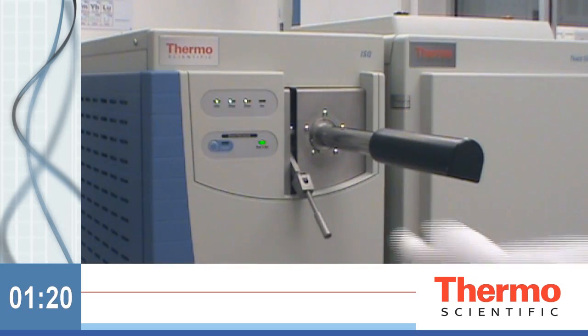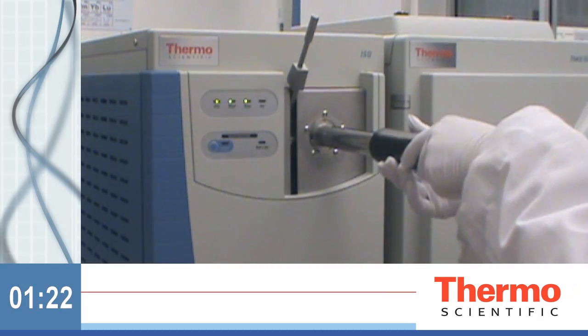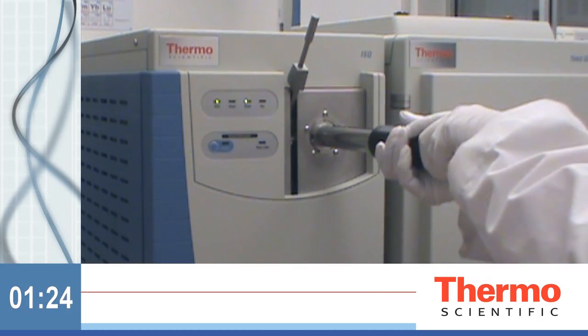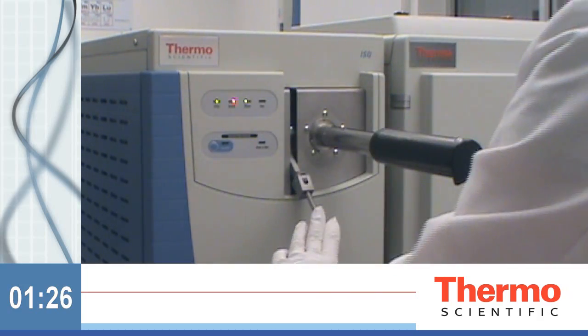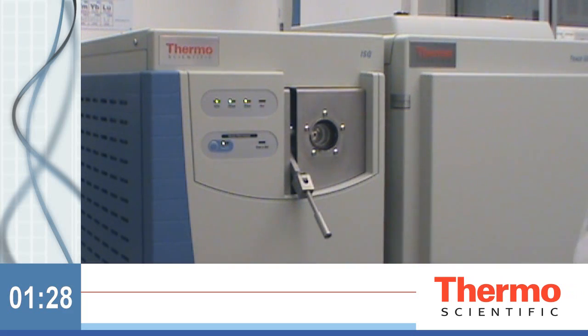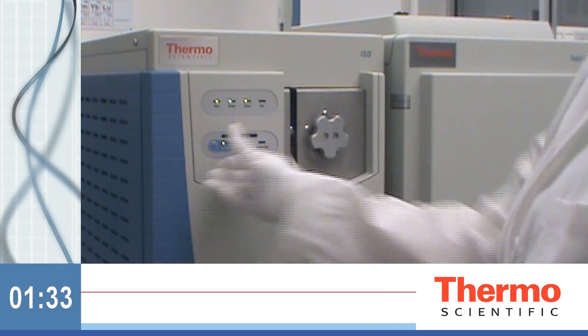When the ready to open light goes green, open the valve, insert the tool, and install the ExtractaBrite ion source. Retract the tool, close the valve, and replace the plug.